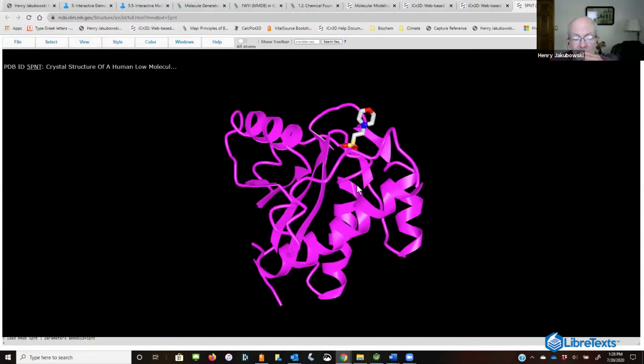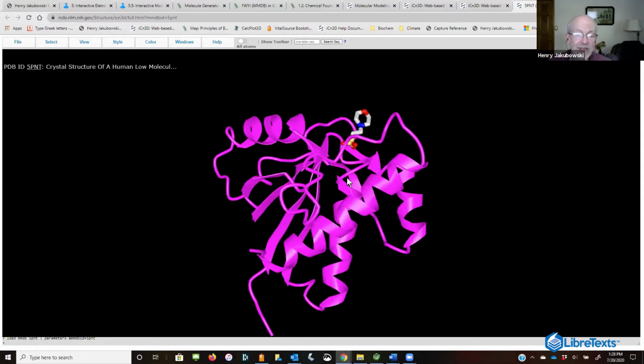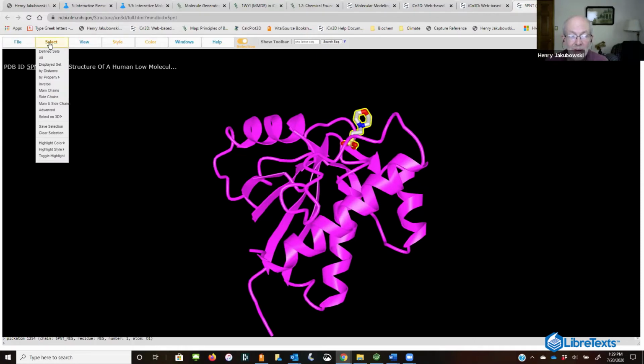Okay. Now, when you see something like this, there's a lot of things you can do. For instance, I want to highlight this residue here. I could do that. If I click on it, nothing happens, but there's an Alt click. So I can Alt click. There are also other ways to select molecules. You can go into the selection command and say, basically, select on 3D. And it will tell you how you can select the chain, domains, residues, atoms, anything you want. But by default, the residue.